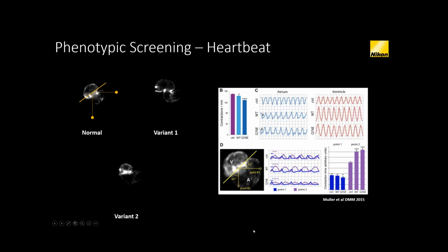along these lines that Mueller et al. were able to do. And it's quite remarkable, both the qualitative data. I mean, we can sit here and look at these really amazing images of organs operating in the different variants, but then we can quantify this using modern imaging analysis. So it's very exciting, but phenotypic screening in vivo only takes you so far.